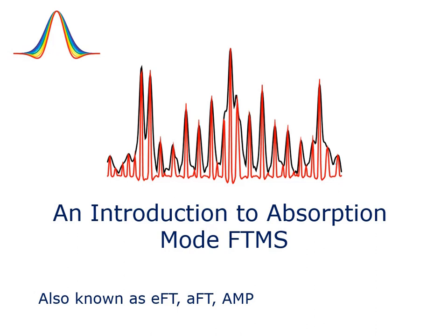In this video, I'm going to be giving an introduction to absorption mode Fourier transform mass spectrometry. Sometimes absorption mode is also known as enhanced Fourier transform, or EFT, or AFT, or AMP, but underneath all of these acronyms is the same concept of absorption mode. And unlike the conventional method of viewing FTMS data, called the magnitude mode, with absorption mode it helps to understand a bit about what it is in order to help you get the benefits from it that you will be expecting. So I hope this video helps you understand what absorption mode is and how you can get the best out of it.